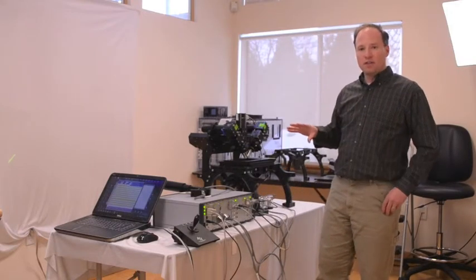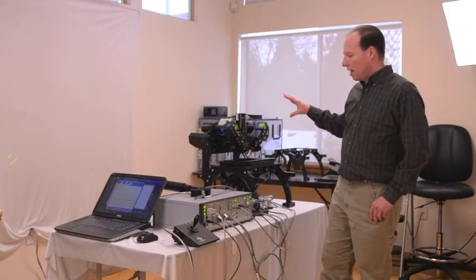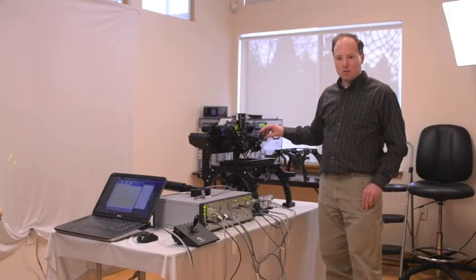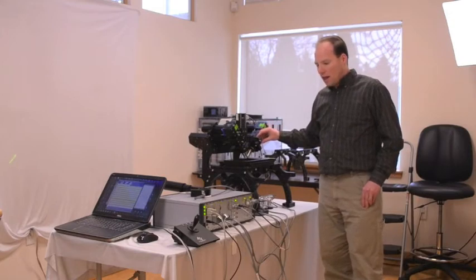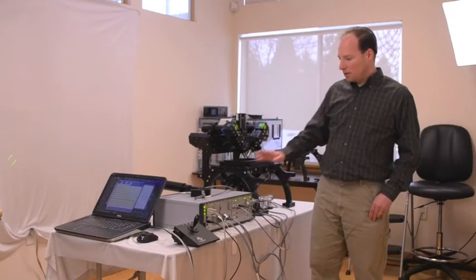But the coordination of the different DI SPIM elements, like coordinating the light sheet with the piezo objective movers, and the camera trigger, that all takes place in the controller.